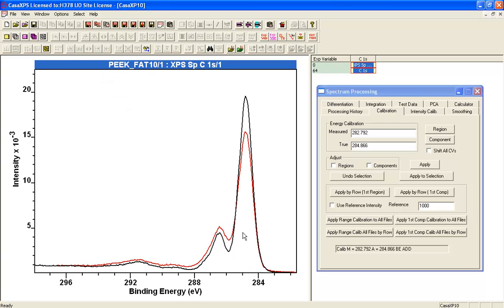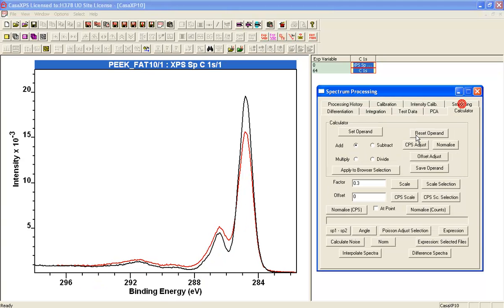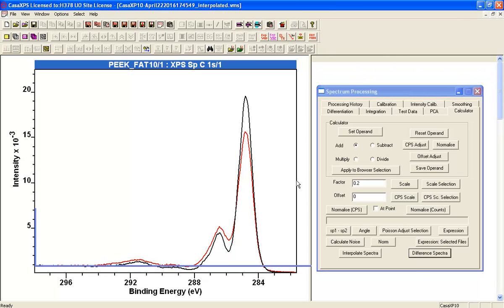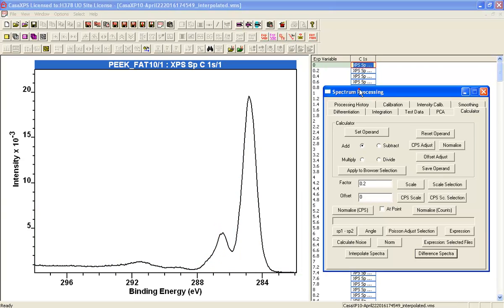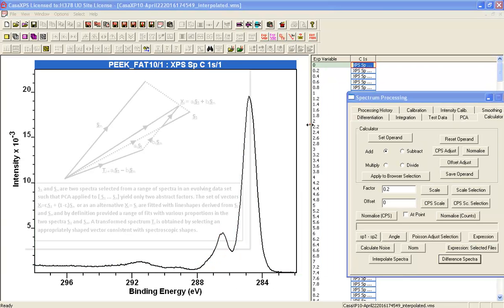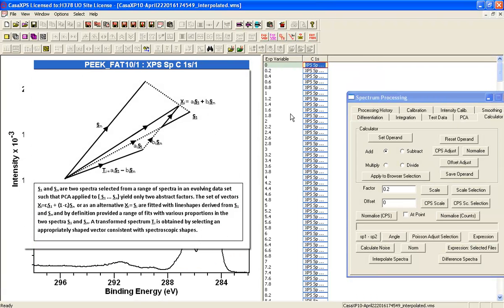So I can inspect these and one of the things I will do is just go for a difference of these two spectra so I can see what might emerge as I run through a sequence of different spectra starting with the initial one.